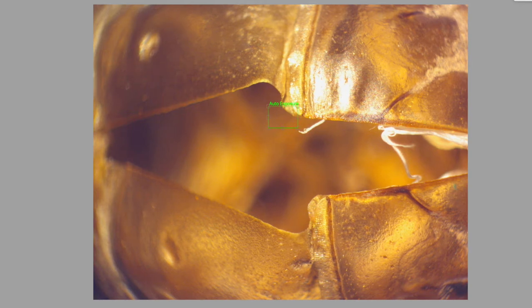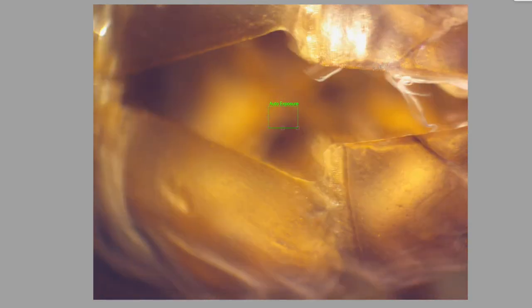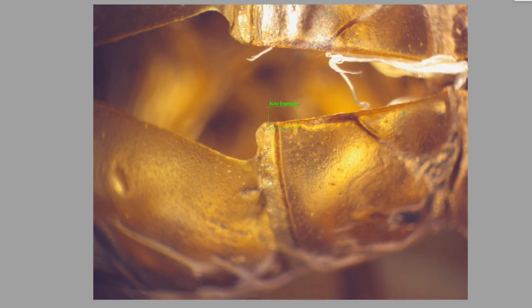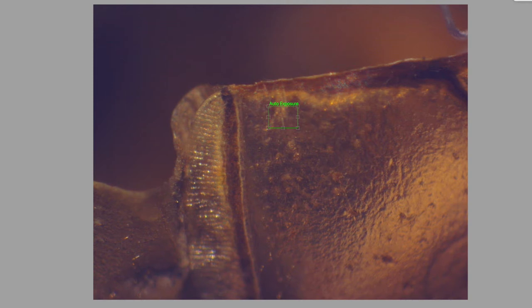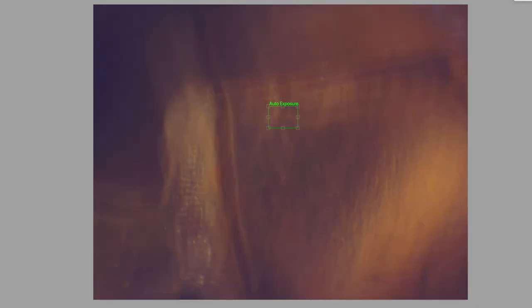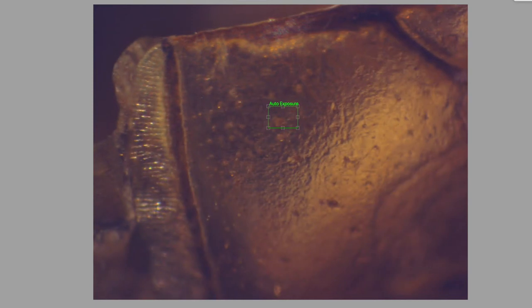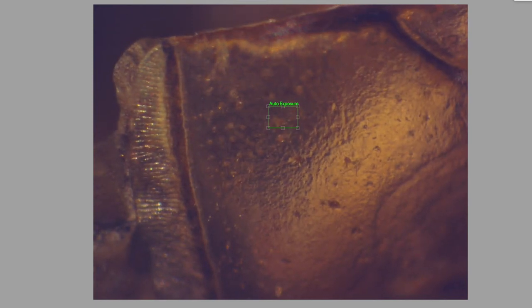Now, bugs, you might not realize this until you've looked at a bug under a microscope. They are all super hairy. And they have hairs all over them that allows them to kind of sense. Oh, we have some hair there. Let's just go to 30x. Yeah, you can kind of see some of the hairs there. It has like this armor plating, and so this exoskeleton is just like a mold in essence.